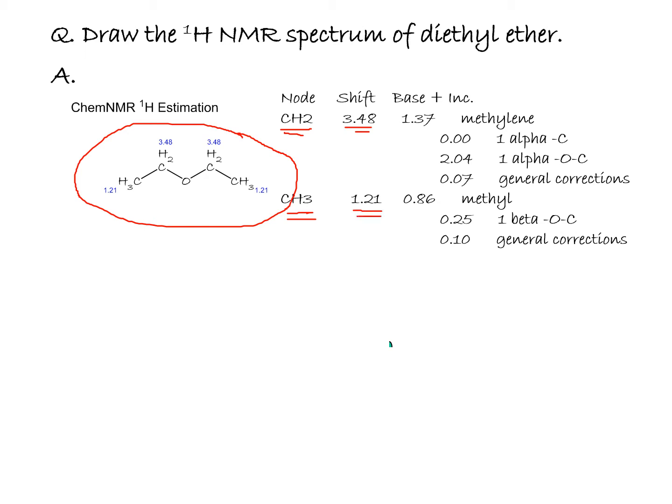1.21. Remember that these two methylene protons are equivalent, and the CH3 protons are equivalent to one another. We can say via C2 axis of symmetry.